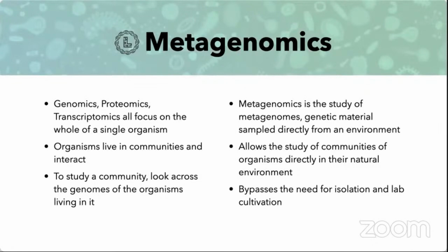And the ability to identify these microbes without a priori knowledge of what the sample contains is actually opening new doors into research areas like ecology, virology, microbiology, environmental science and biomedical research, etc. The sequencing-based examination of the metagenome has become an extremely powerful tool for understanding their diversity and their effects in several of these research areas that I just listed, and has become a very useful tool in generating novel hypotheses that relate the metagenome to several of these research areas.